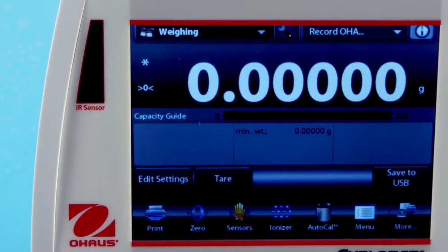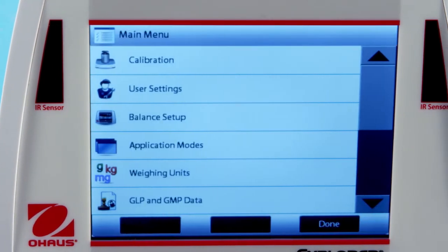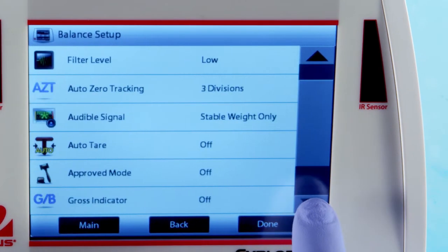Explore the power of its intuitive software with a well-designed, easy-to-operate graphical user interface.